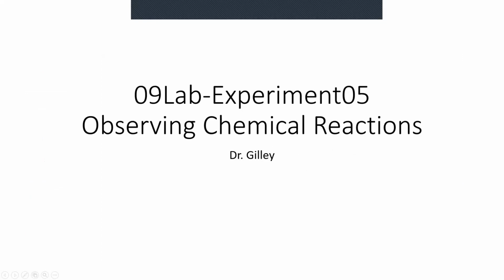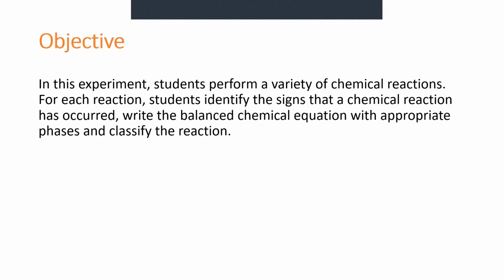Hello, everyone, and welcome to the pre-lab lecture video for Lab 9, Experiment 5, Observing Chemical Reactions in CHEM 100L. So the objective of this experiment is for students to get some experience performing a variety of chemical reactions.